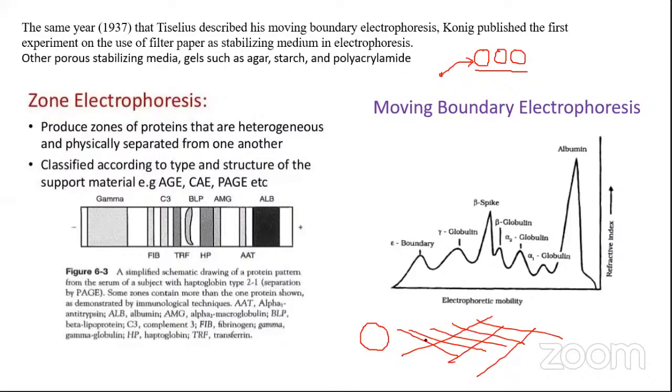Now, before I go any further, let me first understand whether you have a background of understanding what gels are in general. What are gels? If you have studied something about colloidal systems, then perhaps you would be able to recall what exactly gels are, what type of colloidal system it is. Like in colloids, you have a dispersion medium and a dispersed phase. These are the two terms that we normally use.